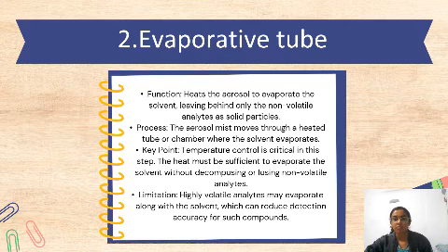An important point is that temperature control is critical in this step. The heat must be sufficient to evaporate the solvent without decomposing or losing non-volatile analytes.